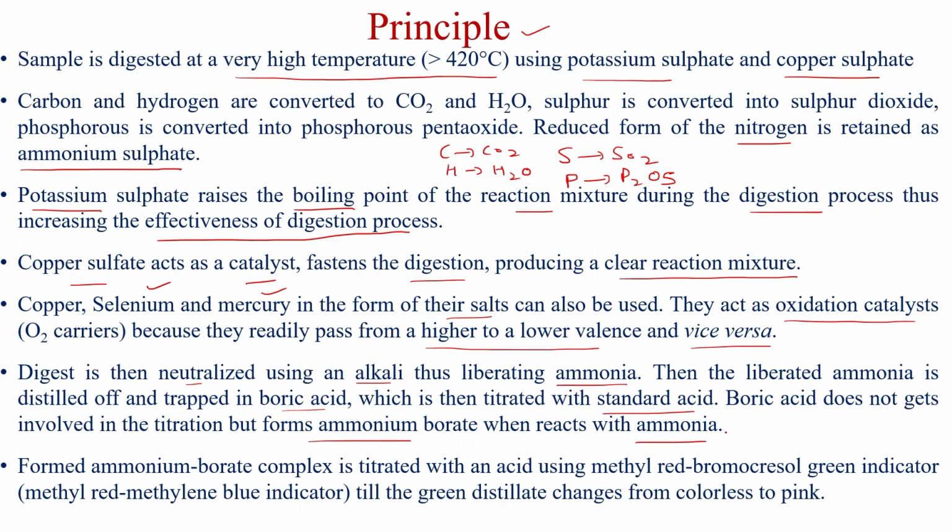So we will see that boric acid is actually not involved in the reaction, but it first forms the ammonium borate, and then in the next step boric acid is released as such. We will see that in the reactions.